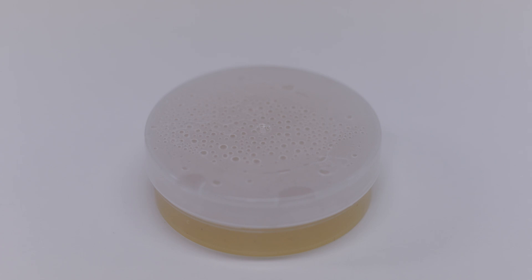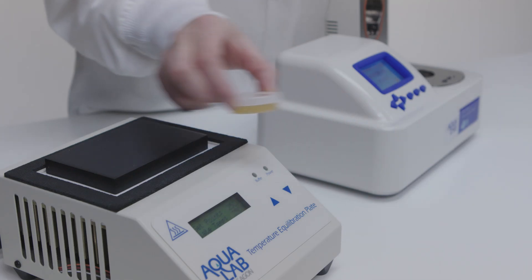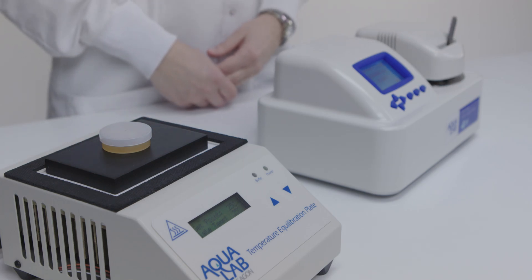One way to reduce read times is by bringing the sample to temperature before putting it in the instrument. If temperature differences are slowing down your read process, consider purchasing a temperature equilibration tray, which brings samples to a set temperature before you read them.